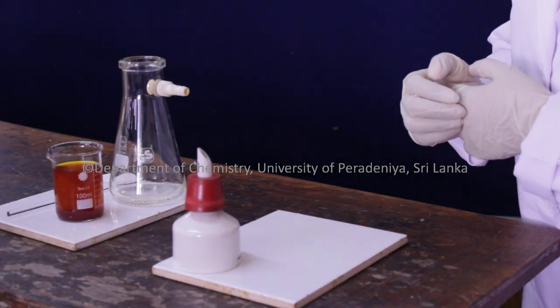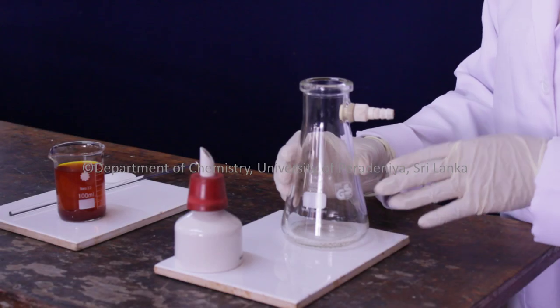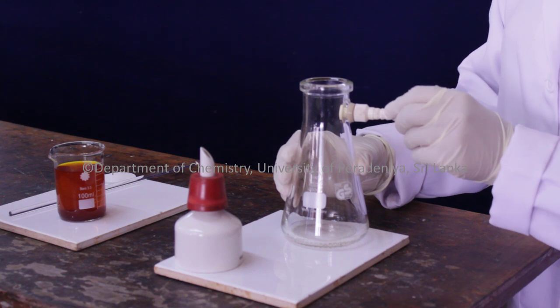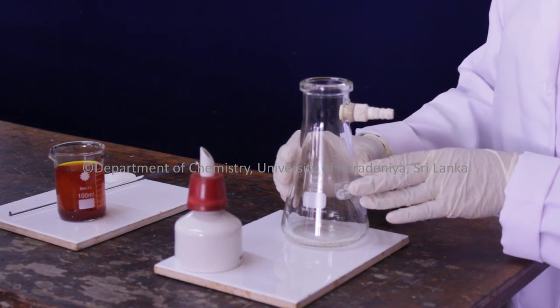This Buchner funnel is often used in combination with a Buchner flask. A Buchner flask is a thick-walled Erlenmeyer flask with a glass tube outlet, which we can connect to a vacuum via rubber tubes.